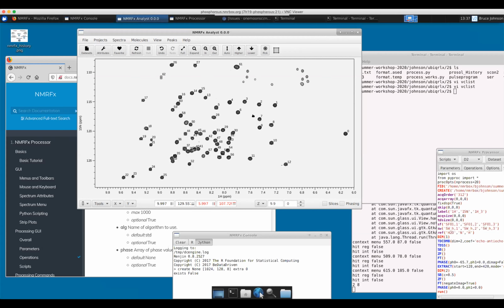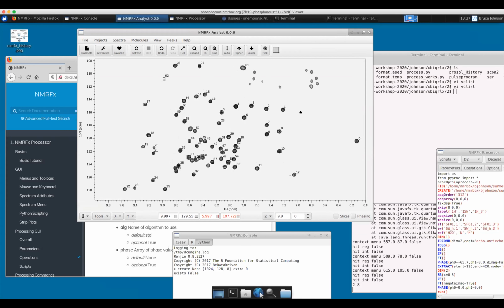Yes, Alexander, hand up. I just have a question more on the practical side. If you don't have a T1, but let's say in a kinetics experiment you measure a series of HSQC spectra as separate 2Ds rather than one pseudo 3D. Can you combine it in a single data set to take advantage of this kind of 3D fitting?